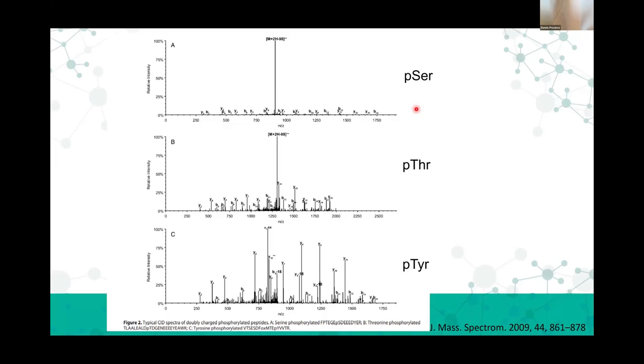It's not on the top flyer list because we're making positive ions, and now this is a peptide that we're putting a negative charge on with a phosphate. So it's more difficult, so it's going to ionize less. And now when we fragment it, the normal fragments that are produced from a peptide are at lower abundance.